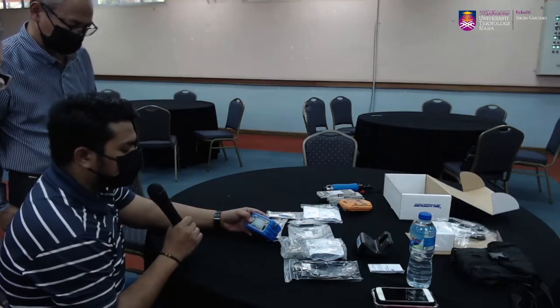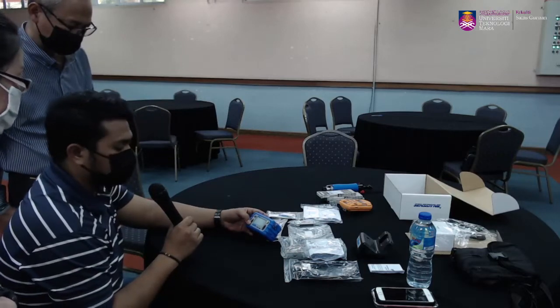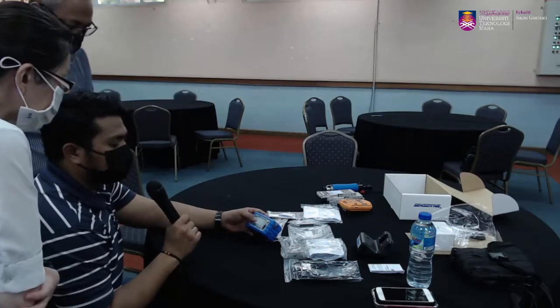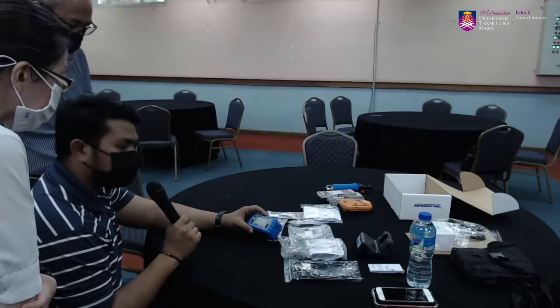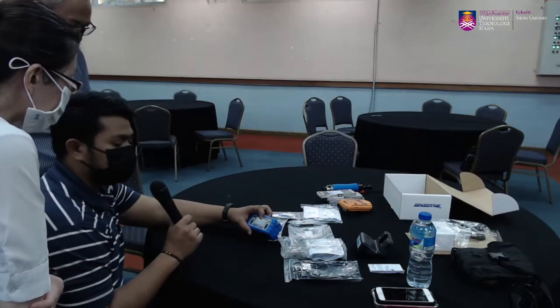So kalau for instance kita nak setkan based on kita punya NMAM yang kita refer kepada berapa flow rate dia lah in terms of liter per minute. So kita convertkan kepada cc per minute dan kita transfer. Contohnya lah 2 liter per minute dimensionkan dalam NMAM. So kita kena setkan kepada 2000 cc per minute lah.